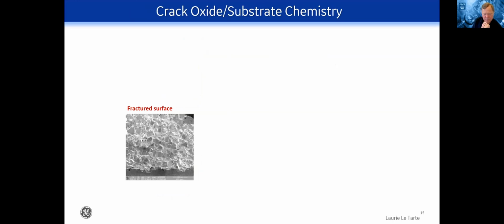What happens when we obtain samples that aren't as pristine as a film, and we want to get the depth distribution? As you can imagine, trying to erode through a sample such as this is not going to be feasible. You're going to have shadowing, blocking. You wouldn't get a nice distribution. This was a fractured surface that needed to be analyzed and understood.